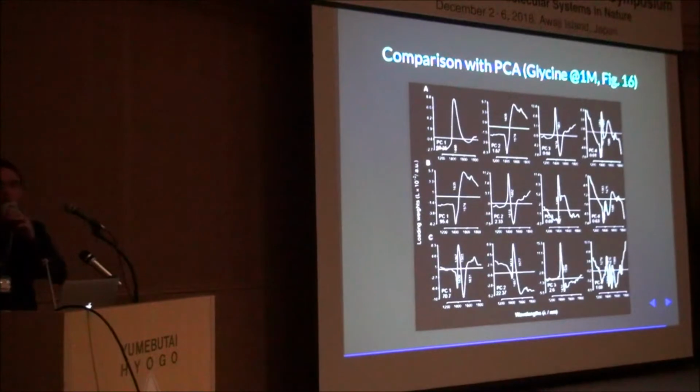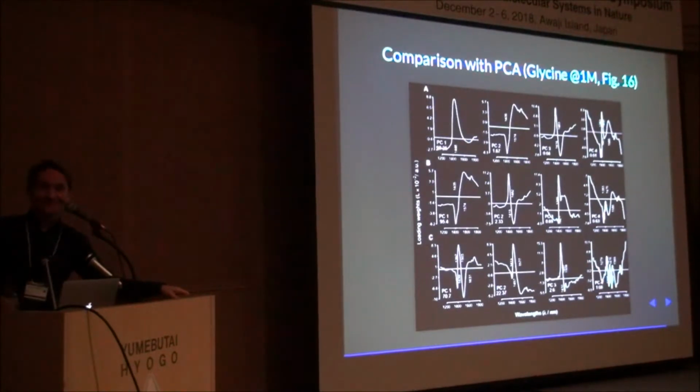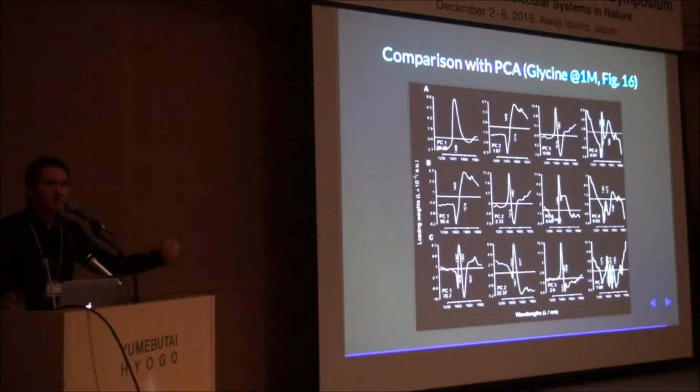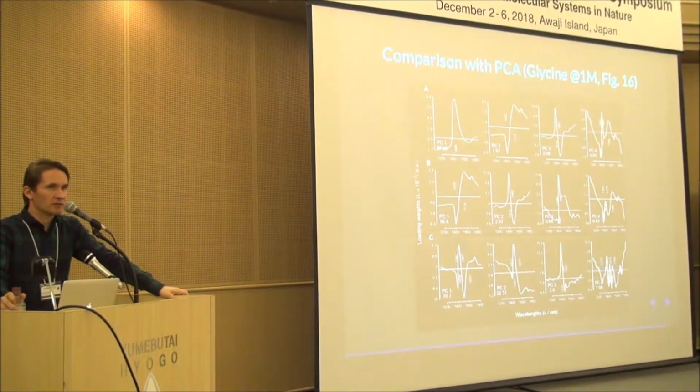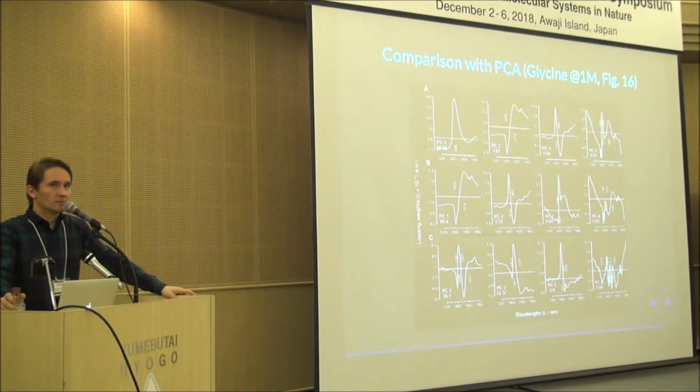Thank you, Dusan. My question is, you mentioned that a considerable collection of spectra is required as a background database. So what is your feeling how large, how wide this pool of reference spectra has to be for the method to be effective and generally applicable? Thank you so much for that question. That's something I'm thinking about recently. The database that we had when the paper was published had about 11,000 spectra. Now that I've mastered taking spectra better, I'm down to 2,000 spectra.